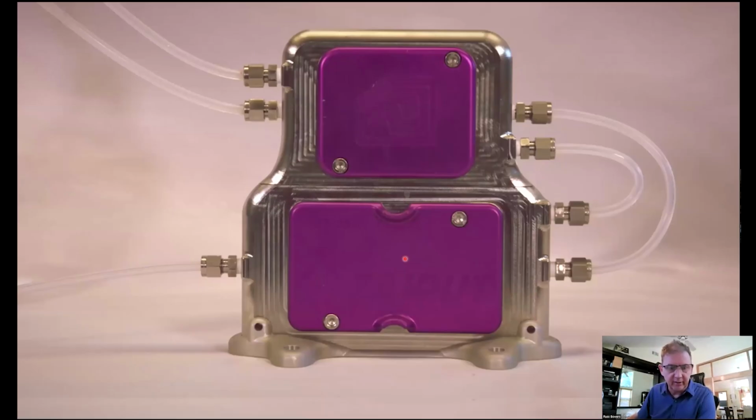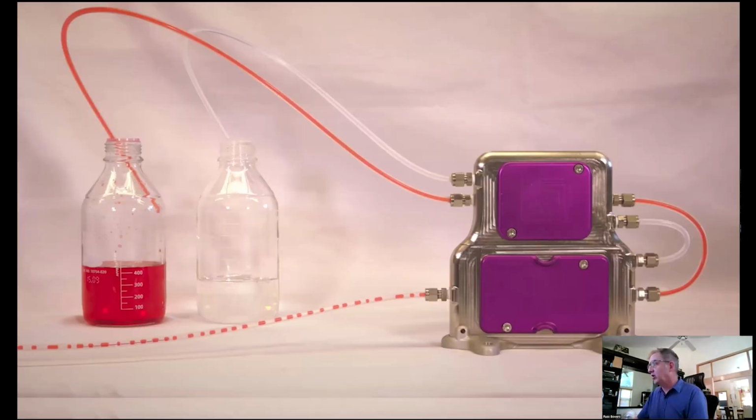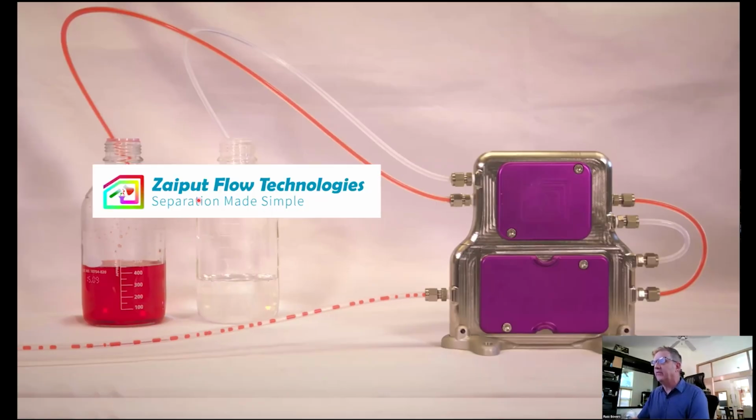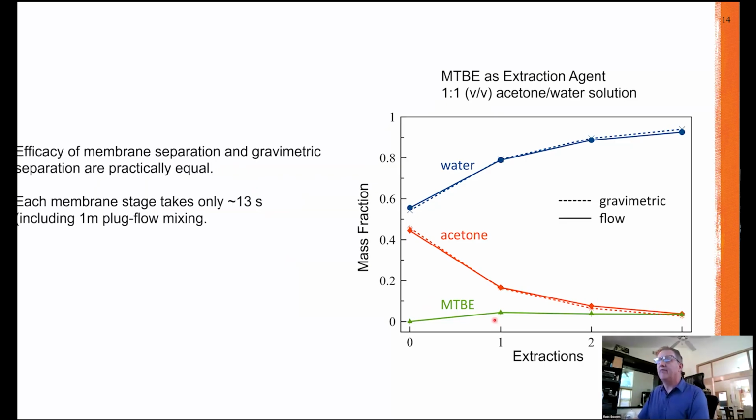Let's see if I can get this to work. You see the liquid coming in as an emulsion, and it's separated in real time almost completely in this example because they colored one of the phases. So this technology is available commercially from Zaiput Flow Technologies, and we compared it with gravimetric separation and showed that you get almost identical efficacy of the separation to gravimetric separation.